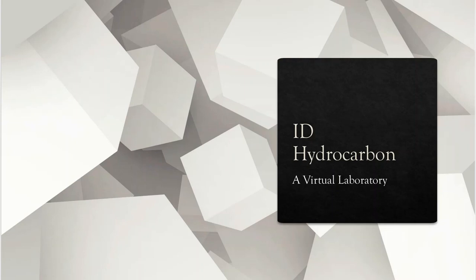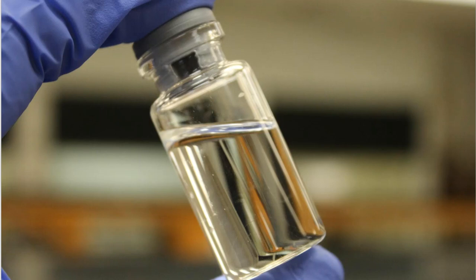So in this laboratory experiment, we are given an unknown liquid solution. And it's going to be up to us to figure out what that unknown is going to be. Now, I'm going to go ahead and give you a trick. If this was really me and I had no lab experiment to go by, I would take this unknown liquid and take it to our infrared spectrometer that we call IR. I will put a few drops on the IR instrument, and folks, it's going to tell me exactly what it is. That's how easy this will be.